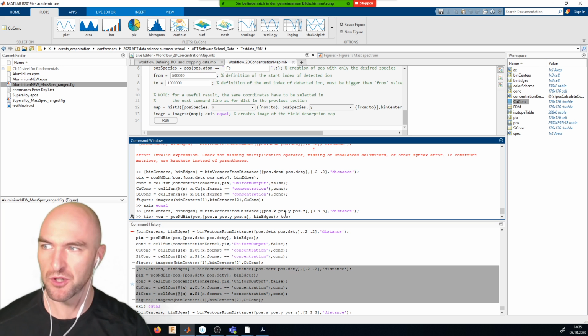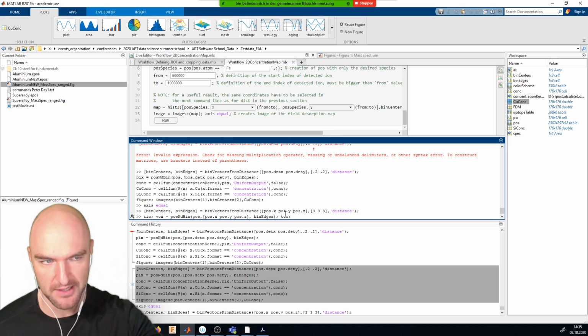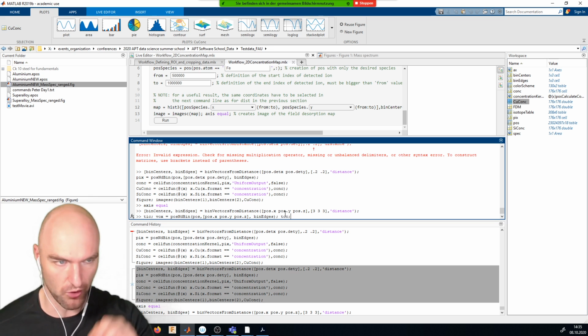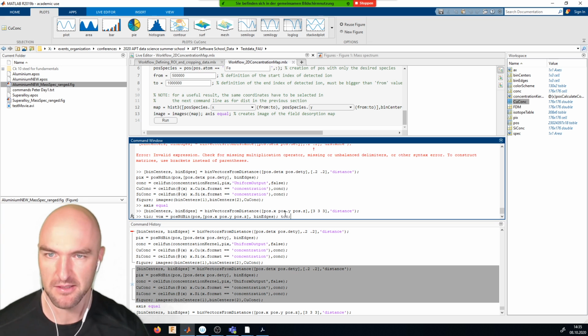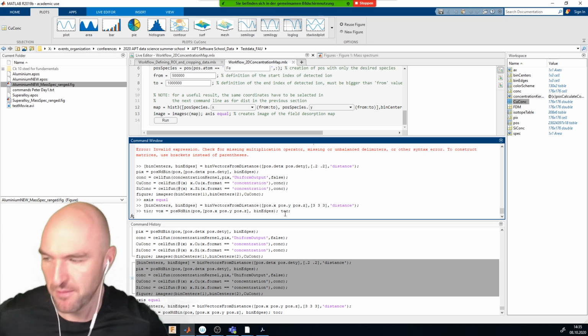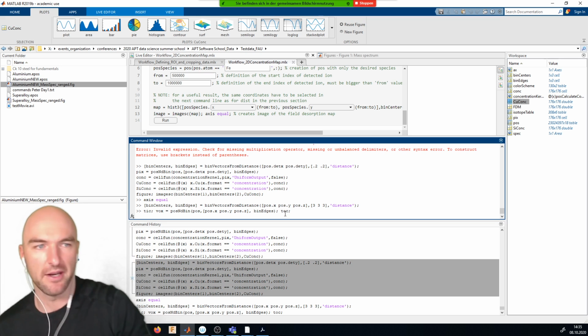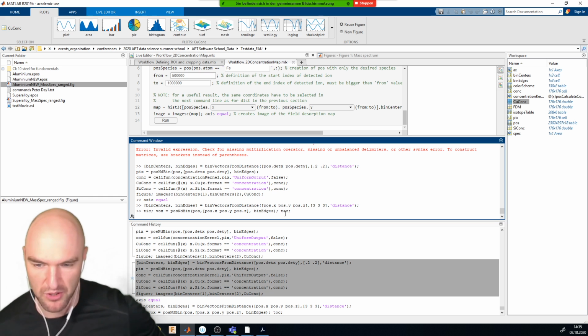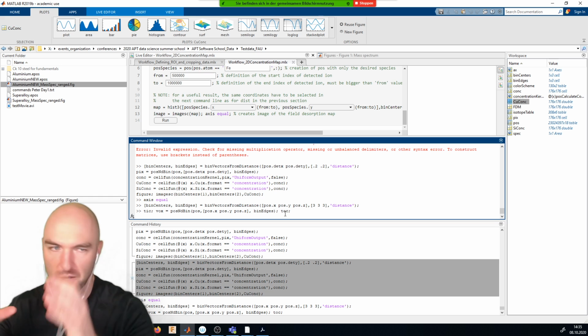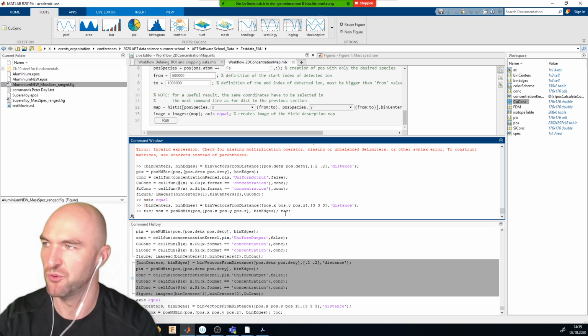So if you want to do something like have an advanced concentration kernel, go through your individual sub-POS files and really deconvolve things. Maybe you have a problem where you need a voxelization and an isosurface or some information about something where you have some bad overlaps between two elements.